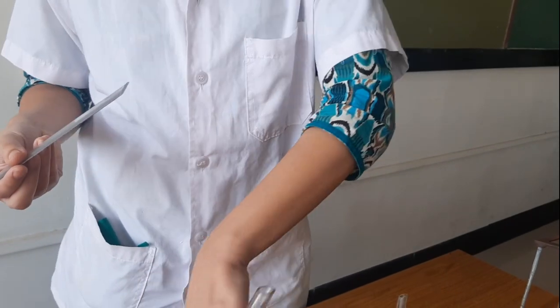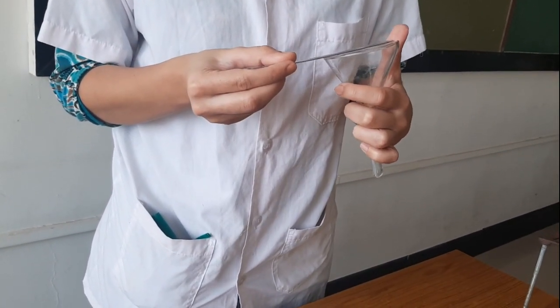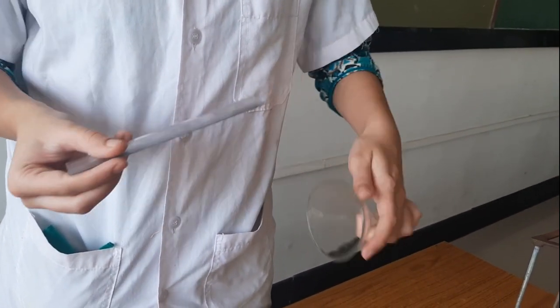The smallest funnel, funnel C, is 7 centimeters. Now we are going to proceed with the first part of our procedure.